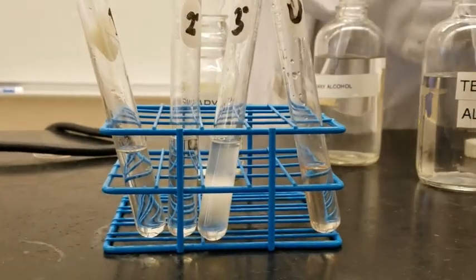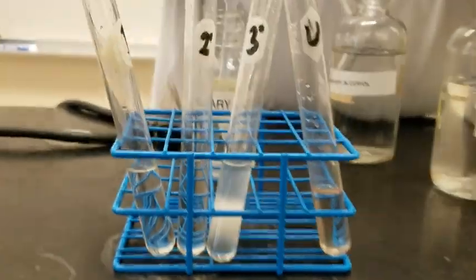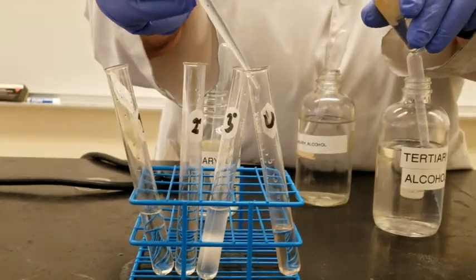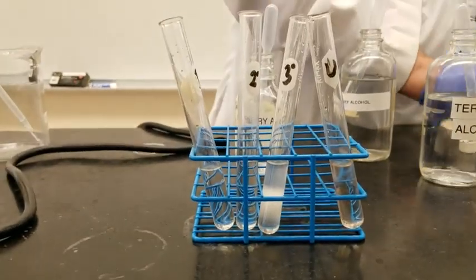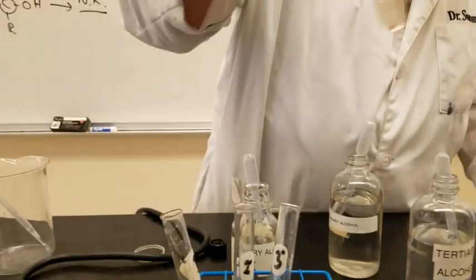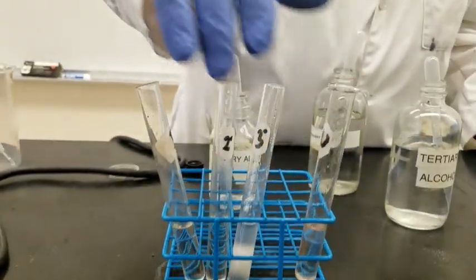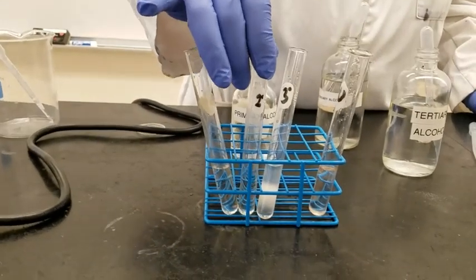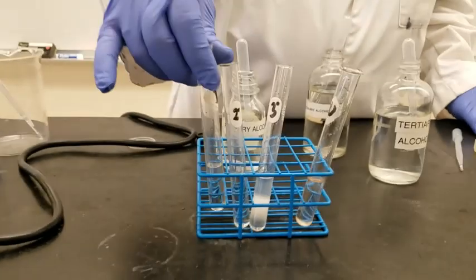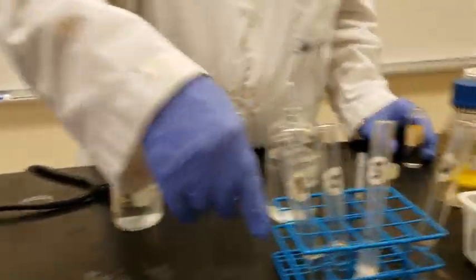And the unknown is here, number 5, as we said. Okay, so we will add number 5 here, 2 in here, and we notice that the reaction still obviously is not tertiary, but you see there is a situation, again, we have to wait a little bit for this to take place, and while we're waiting for this to take place, we will do the iodoform test.